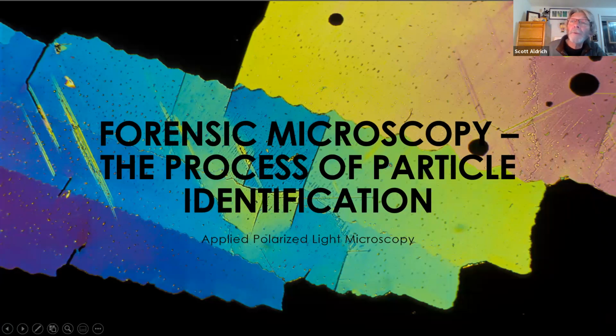But you can see from the northwest to the southwest a wonderful display of color, and that color has everything to do with the chemistry of the specimen, the orientation, the thickness, and that all becomes diagnostic in time. But it's a pretty cool photo.